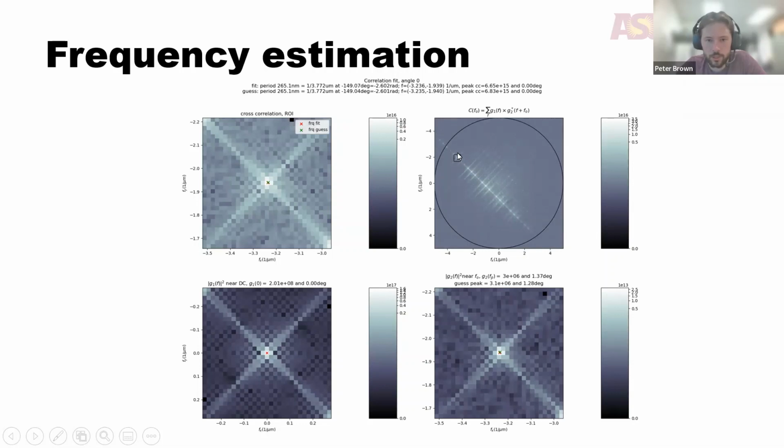Here we show a zoom in around the particular frequency of interest. And we blow this up over here in this upper left plot. And so you could see we're able to nicely identify a peak, which is representing the SIM frequency. It can also be useful to look at the power spectrum of these individual images as well, where we will frequently also see peaks, although of course the only image that we necessarily need to see a peak in is this cross correlation image.